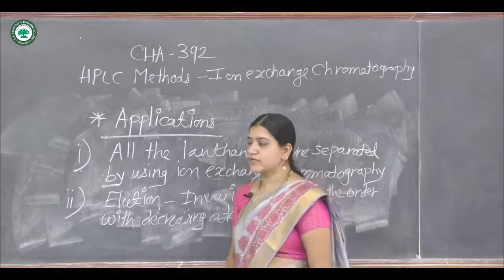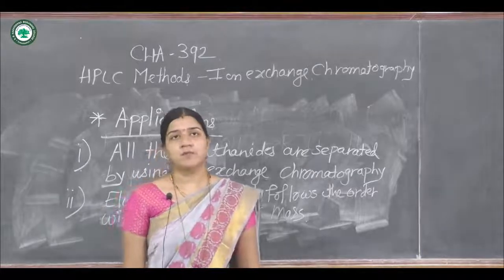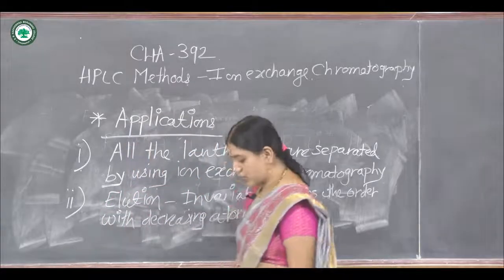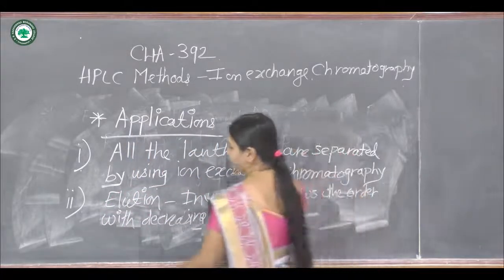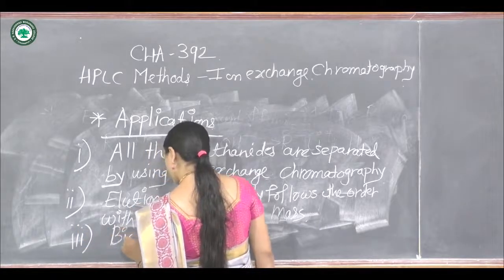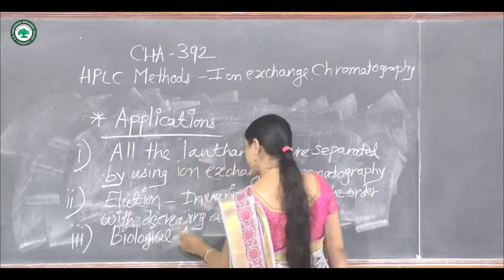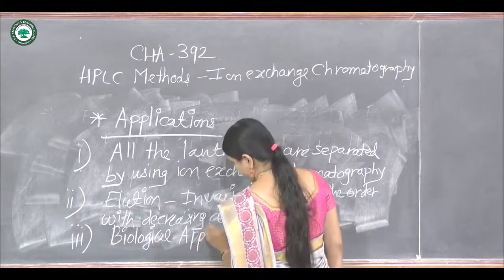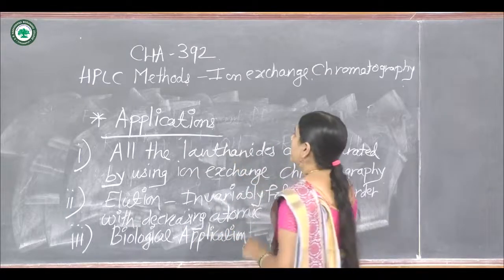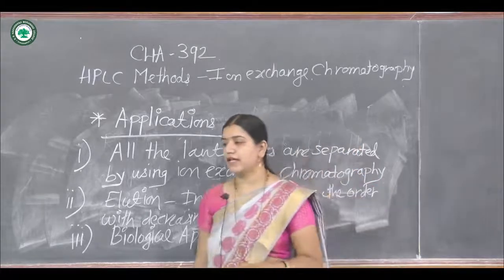Along with this, it also has a most important application in the field of biology. So what is the biological application of this? It is used for the analysis of DNA and RNA.